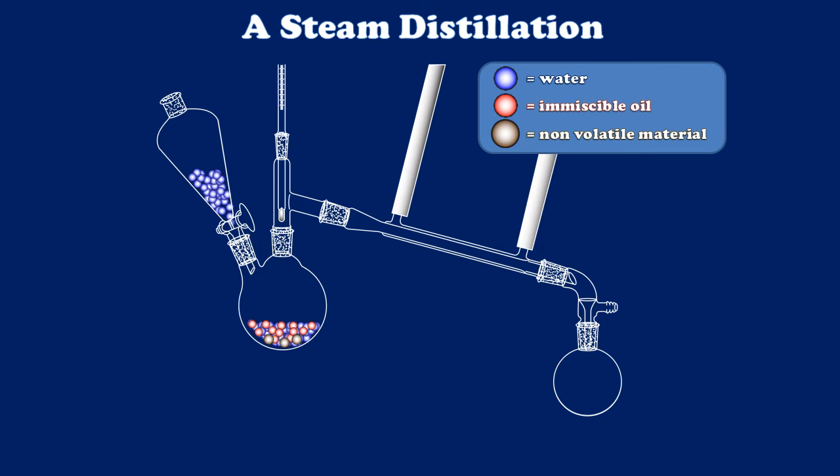As I begin to run a steam distillation, what I'm going to do is open the separatory funnel valve, thereby allowing the water to continually flow into the boiling flask. As I heat that boiling flask, the mixture of water and immiscible oil will begin to vaporize. But remember they're immiscible, which means that their vapor pressures will be unchanging. So as long as there is any small amount of immiscible oil remaining in the boiling flask, some of it will move through the steam still.